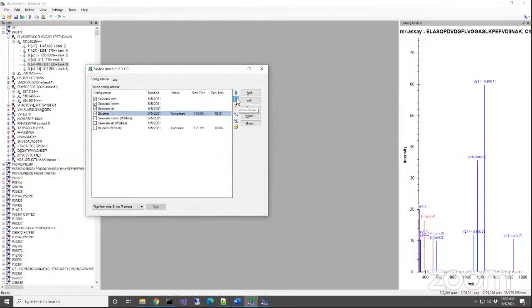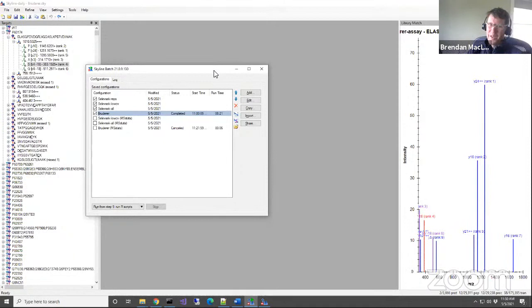So if you want to change orders of things that haven't been run, apparently that already works. So Ali must be, when she finishes the current job, she looks at the order at that moment rather than storing it. So it is sort of a job queue already.